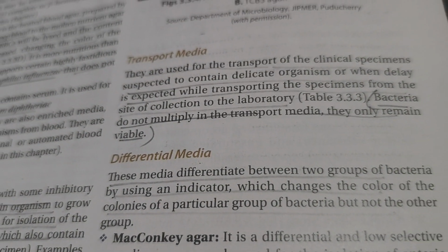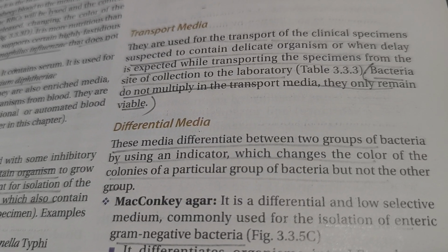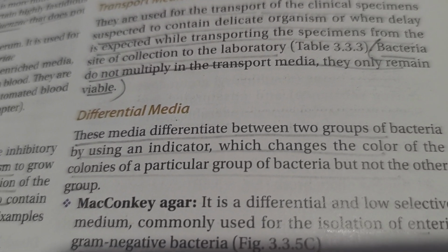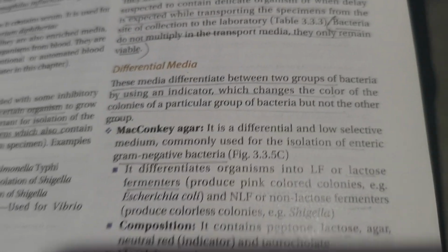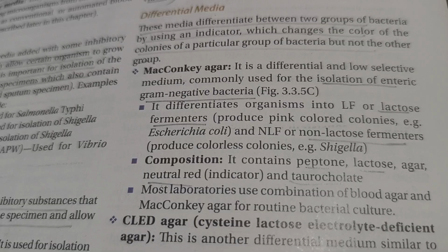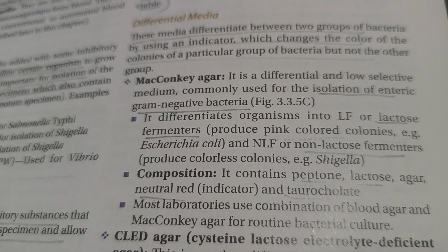Transport media. They are used for transport of clinical specimens suspected to contain delicate organisms or when delay is expected while transporting the specimens from the site of collection to the laboratory. Bacteria do not multiply in the transport media, they only remain viable. Differential media. This media differentiates between two groups of bacteria by using an indicator which changes the color of colonies of a particular group of bacteria but not of the other group.